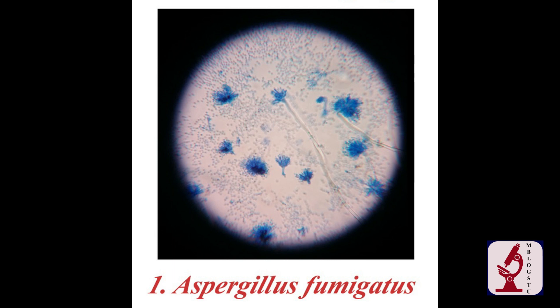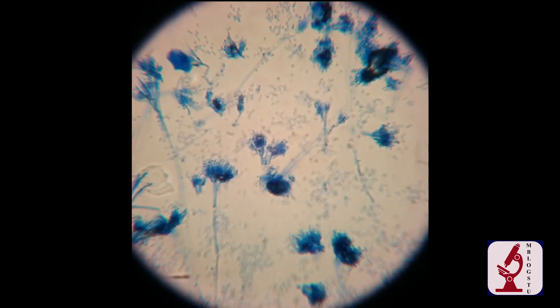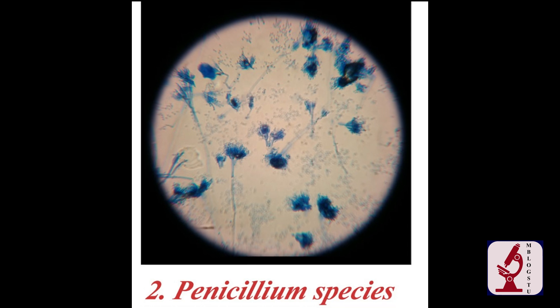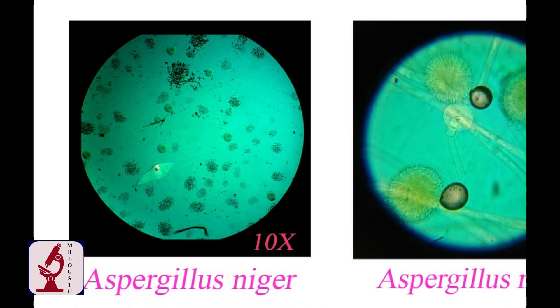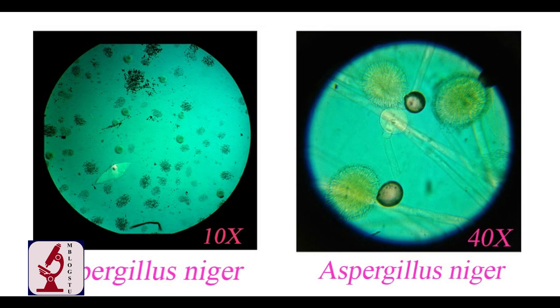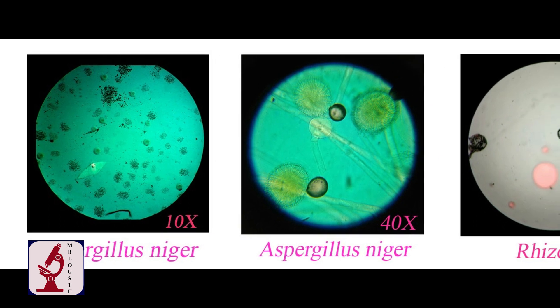Number 1: Aspergillus fumigatus. Number 2: Penicillium species. Number 3: Aspergillus niger. You can see two different images of the Aspergillus niger.